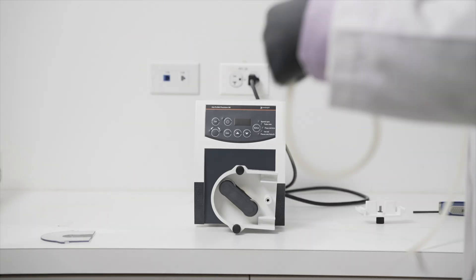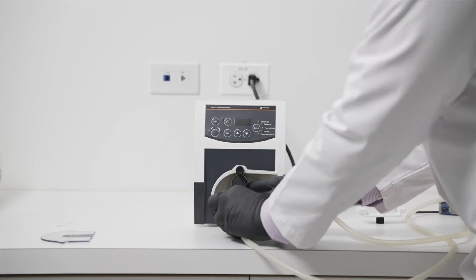The High Flow Ultimate 600 is only able to be adapted to a single channel pump head but is able to reach a maximum flow rate of 4056 milliliters per minute.